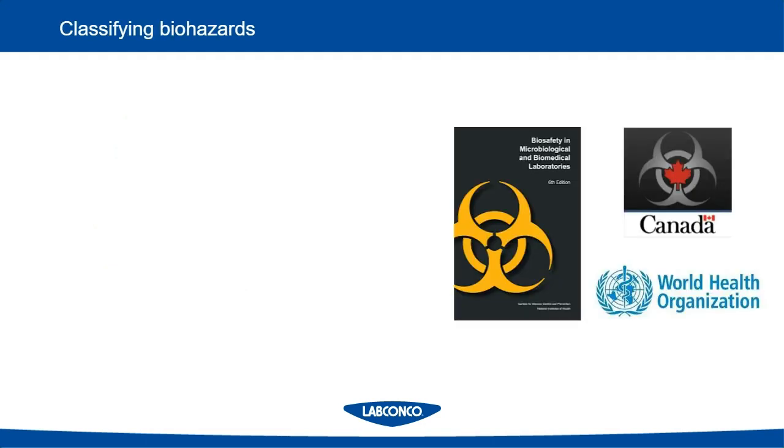When it comes to classifying biohazards, every country has its different regulatory agencies. Within the United States, we primarily work with the CDC, and the CDC publishes a guide called Biosafety in Microbiological and Biomedical Laboratories. Canada has their own version of this guide, and the World Health Organization has a more global standard.